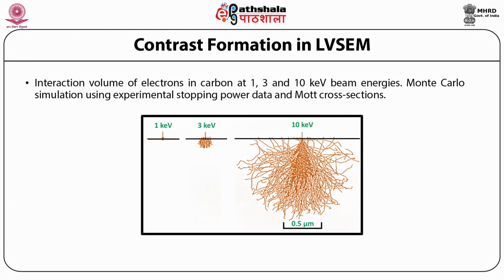As discussed, the changes in the electron-solid interaction with the incident beam energy affect the contrast formation in the SEM images. The most significant effects are the reduction and eventual loss of contrast from topographic image and beam penetration.